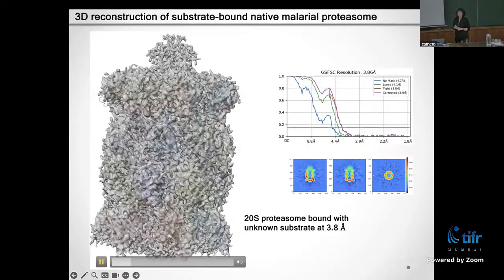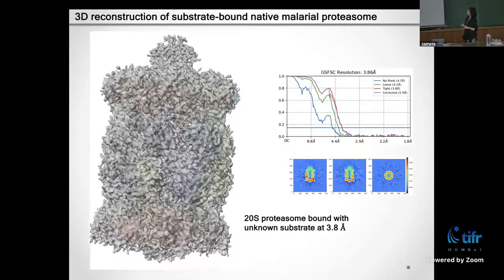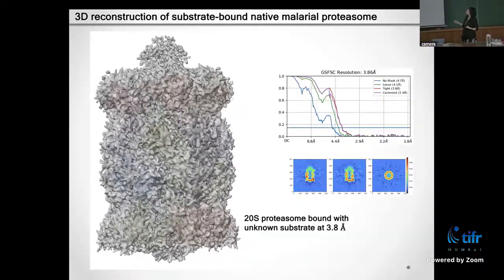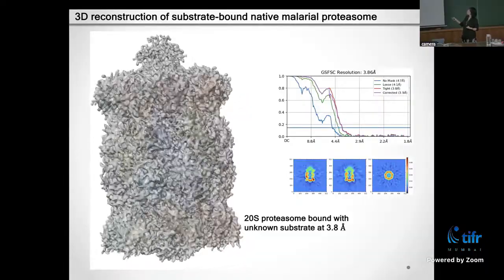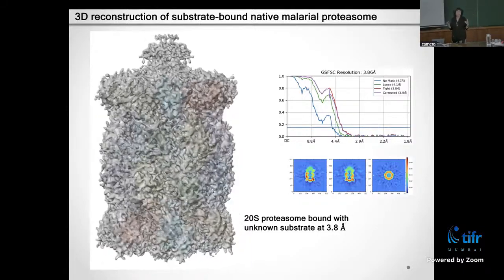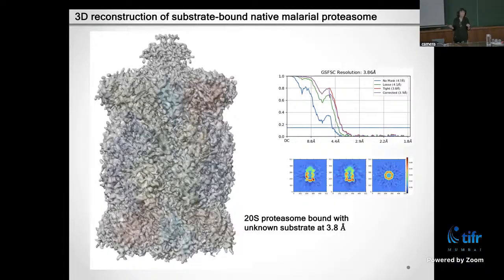in its native state at 3.8 angstrom resolution, which is not bad under the circumstances. And we found that there is something stuck to it. So it is in the process of chewing up a substrate. Proteasome, yeah.